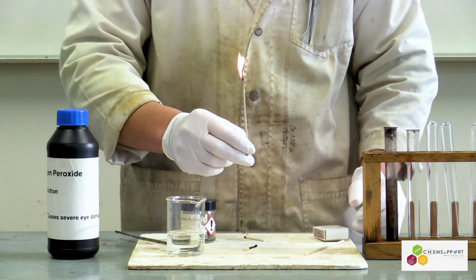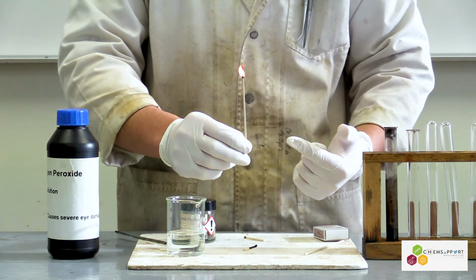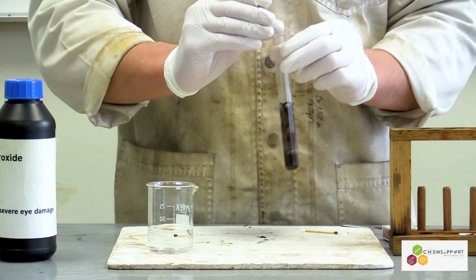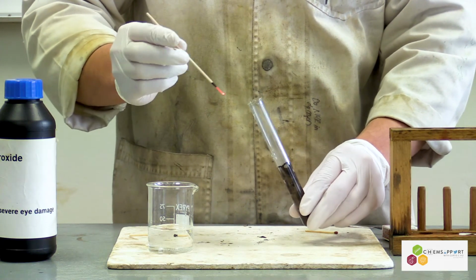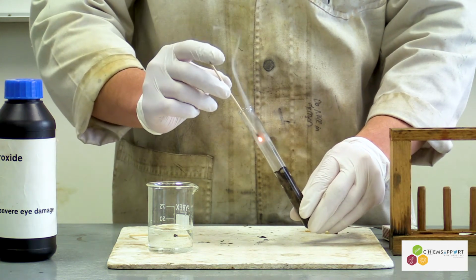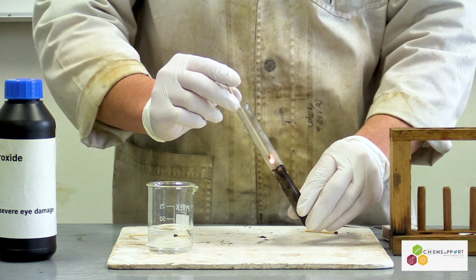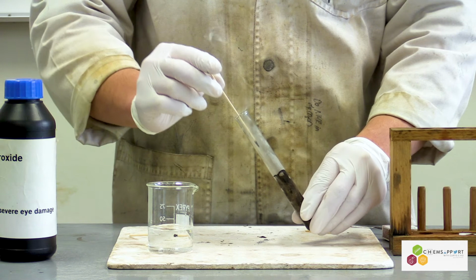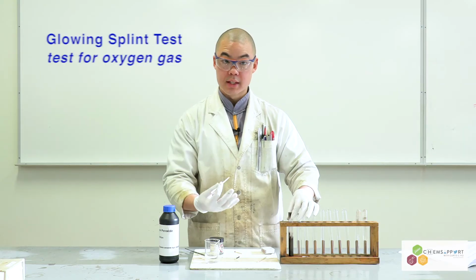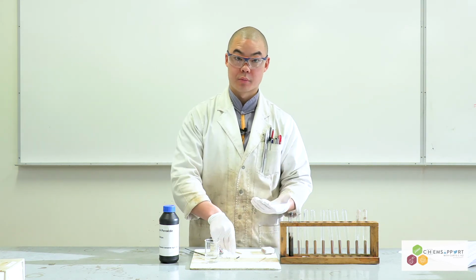we'll let it burn for a little bit until we see this glowing color at the end of the splint, and then we'll extinguish the flame. What we're going to do is introduce this glowing splint into the test tube, and we should see that as we introduce it there, it reignites. And the intensity of the flame gets bigger. So that's a really classic example of testing for oxygen gas produced from this reaction.